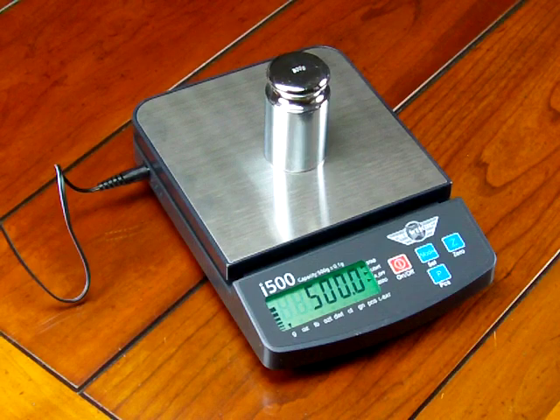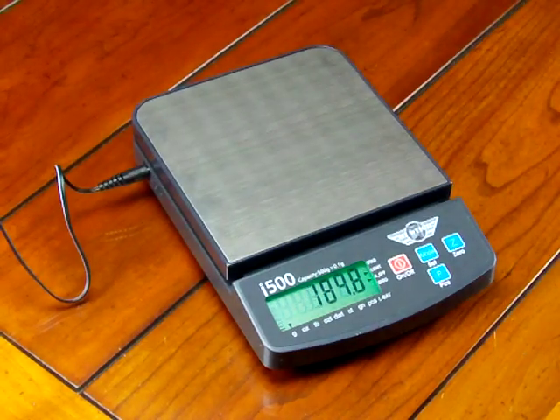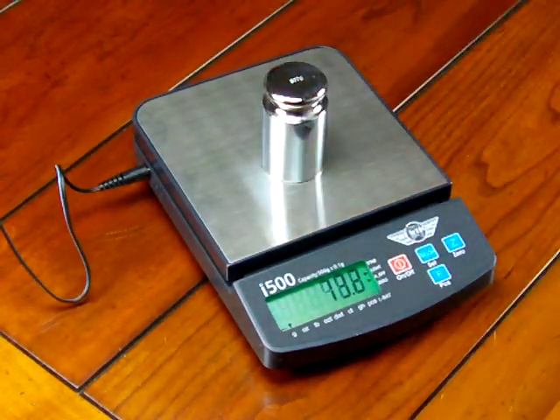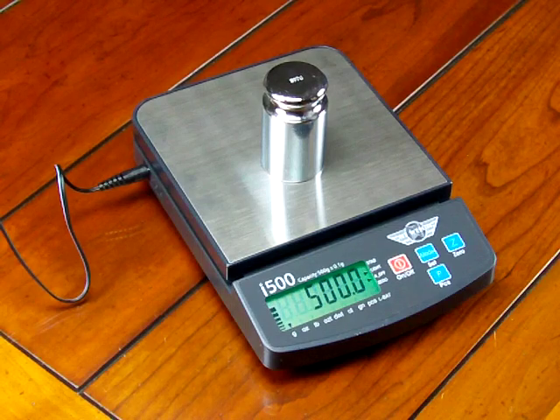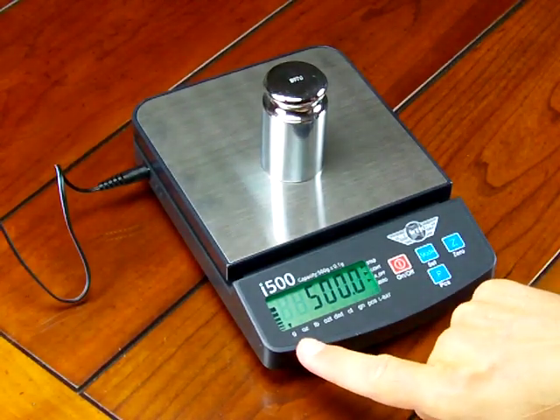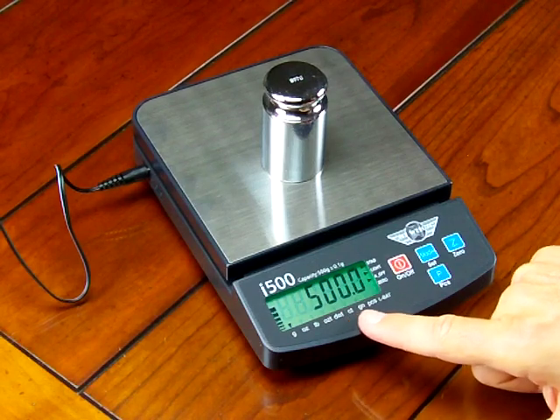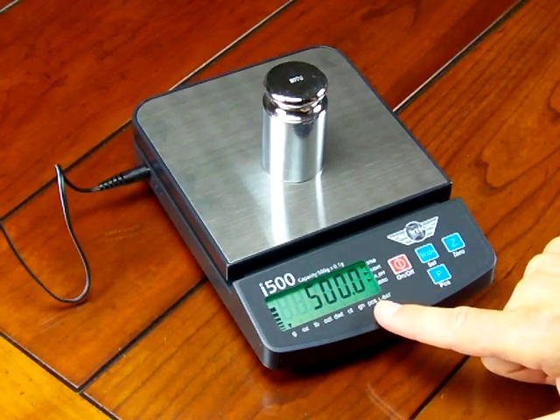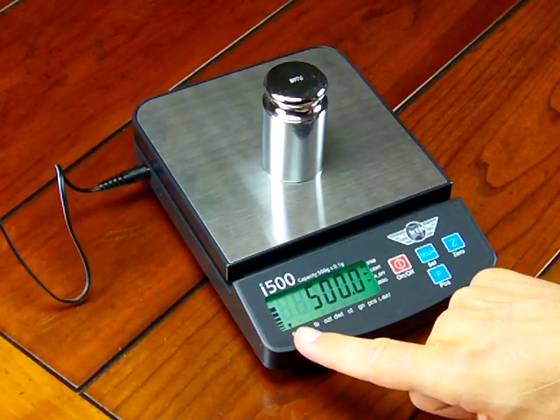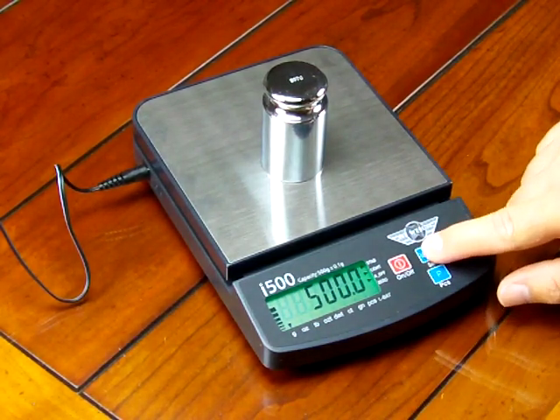A few more features I'd like to show you about this scale that make it very unique. The ability to change weight modes is real simple — all you have to do is press the mode key. You'll notice on the bottom we have grams, ounces, pounds, troy ounces, penny weight, carats, grains, and piece weight. The little arrow illuminates as we change the weight mode. So we're in grams now.